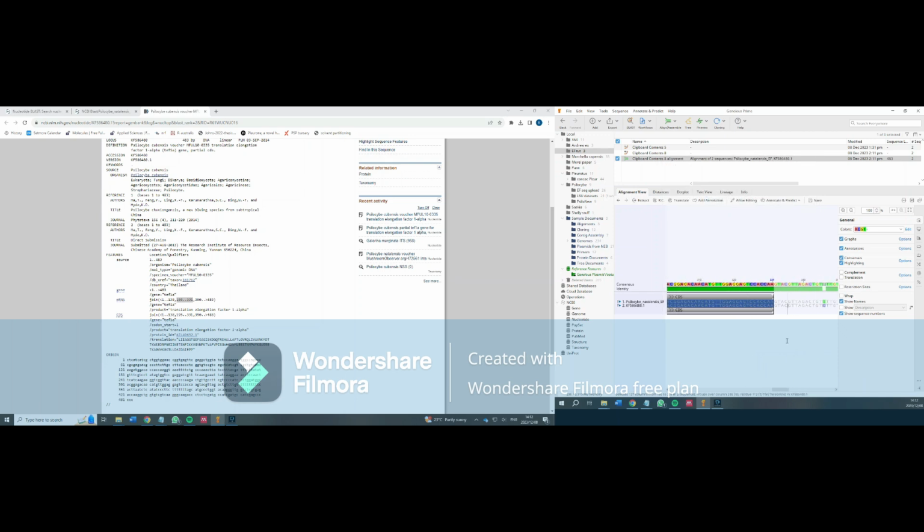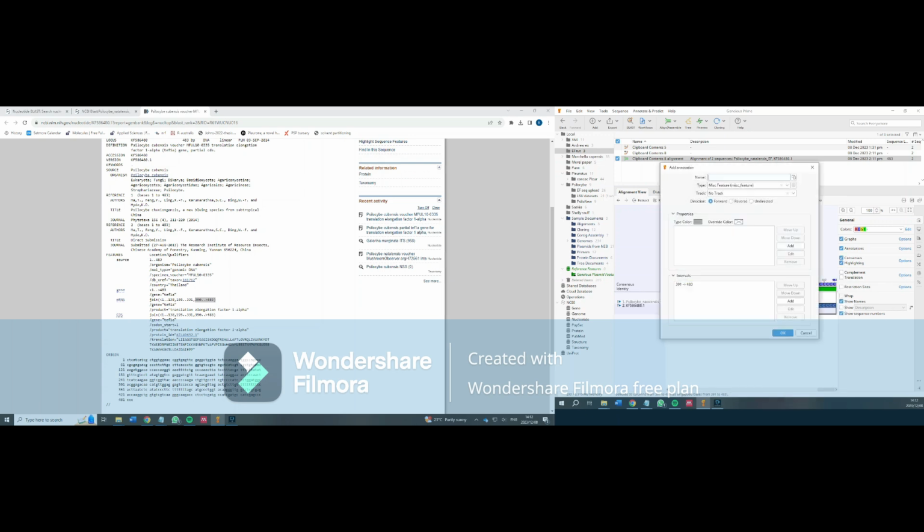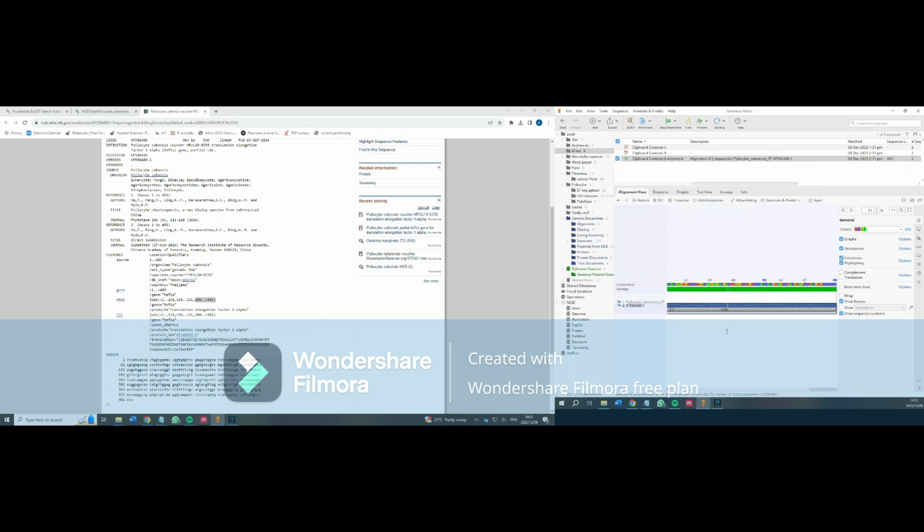And then the last region is from 390. You can see this falls outside the interval of our Psilocybe, the one we're trying to annotate. That's fine, it doesn't really matter. I'm just going to do it anyway, just for the sake of it. And add annotation, same as before, nice and easy. So now if you zoom out, you can see the three different regions. For our one that we're trying to upload, it only has two CDS regions, which are highlighted there. The intervals are also given.